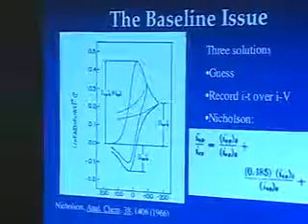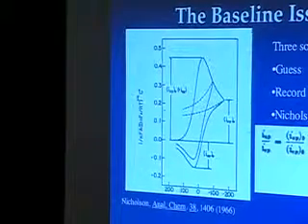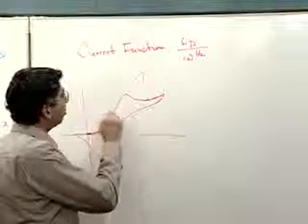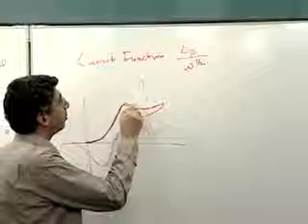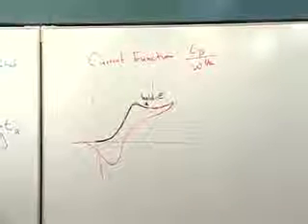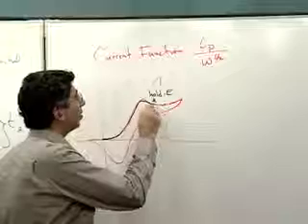So the way that is best is to run a cyclic voltammogram. Let's say it looks like that evil red curve that I've put right there. And then run a second cyclic voltammogram. However, what you're going to do is stop your potential, hold your potential at this point right here, and continue recording the current on a time axis. So switch over from a potential axis here to a time axis.